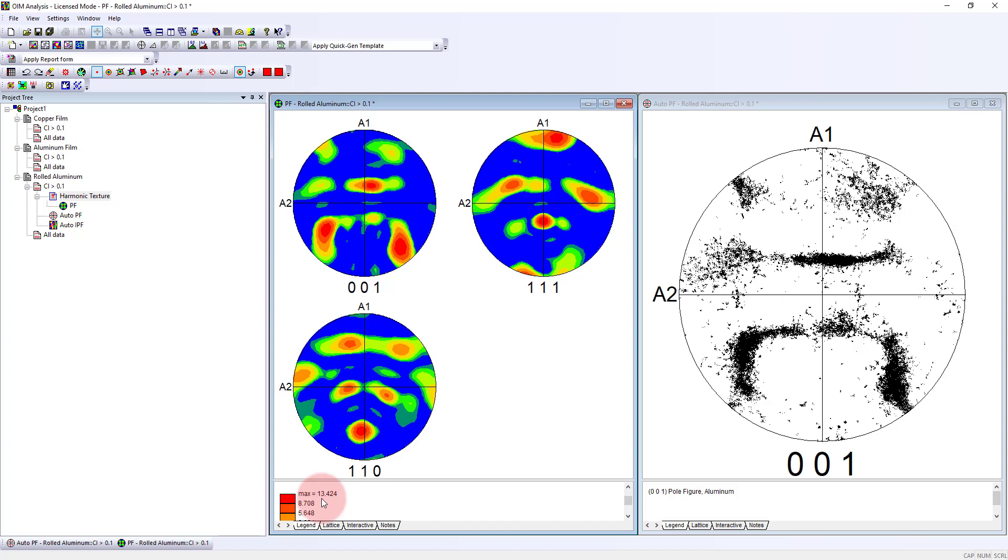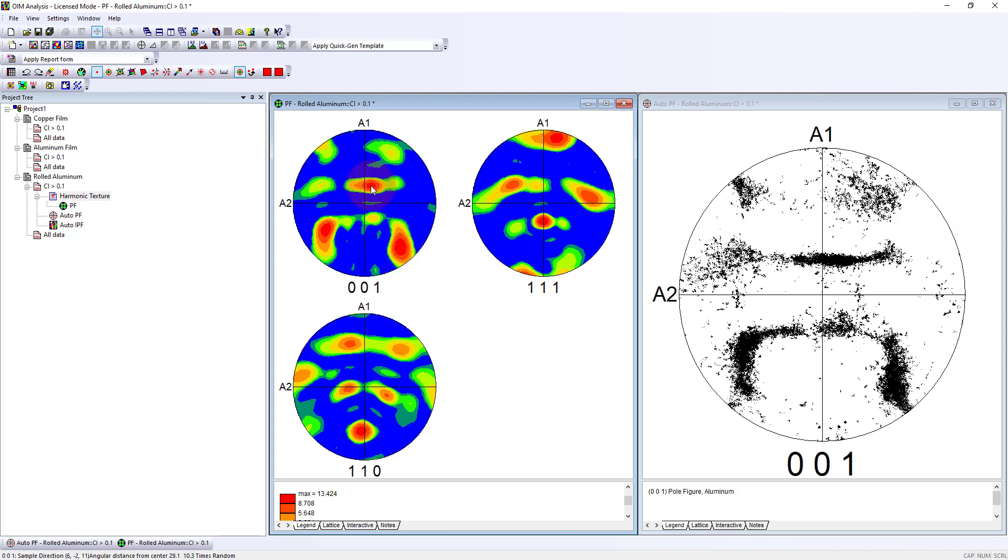If orientations were randomly distributed everywhere, the times random value would be one. When we see this above one, it indicates there is a certain preferred orientation as we'd expect for a rolled aluminum. As I move my cursor around, the bottom shows the times random values for different peaks. That peak is approximately 10 times random, and the blue areas are closer to zero times random. This gives us an idea of how strong texture is and how it's distributed spatially.